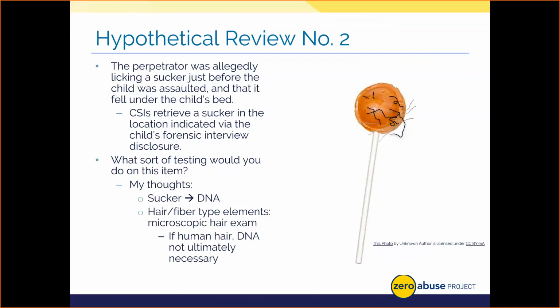It can be really time consuming and laborious. On the flip side of this notion, I really want you to start thinking about what testing services you really need in your cases and what's the most probative analysis for these items, to make sure that you're not getting duplicative results or confounding the triers of fact by over-inundating them with information.